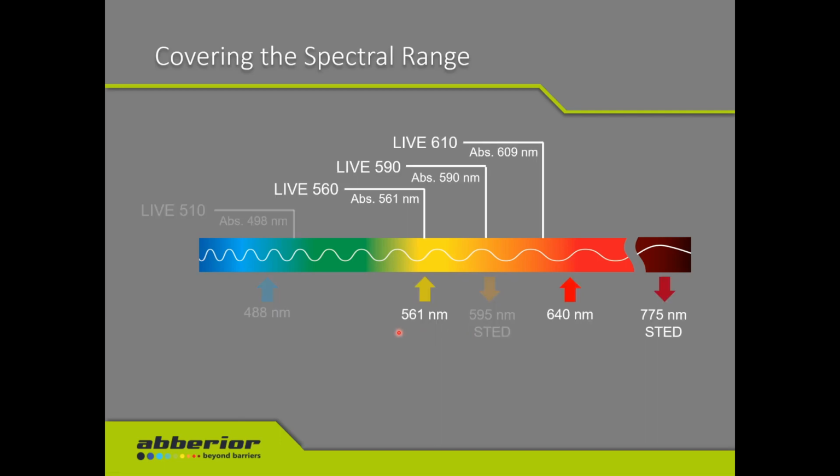Or with the use of a 561 nanometer laser, we can excite the Live 560 and the Live 590, for example, and with a 640 nanometer excitation laser, we can excite Live 610. And these 3 dyes can be used for STED microscopy using the 775 nanometer STED laser.